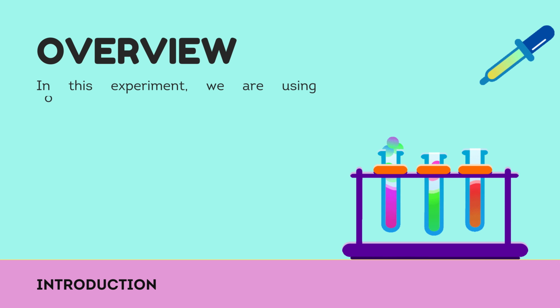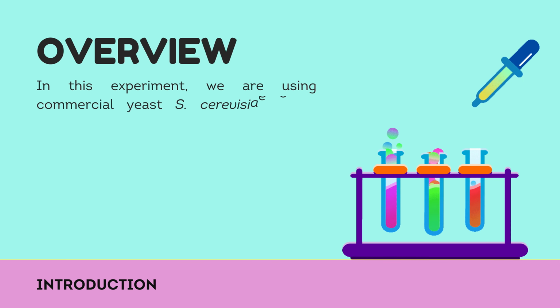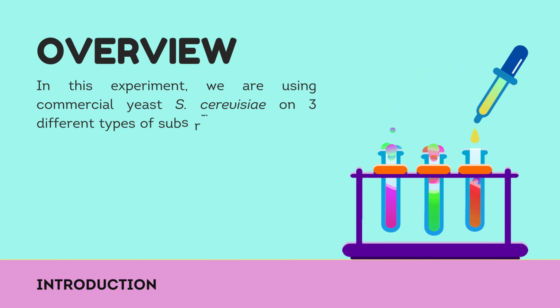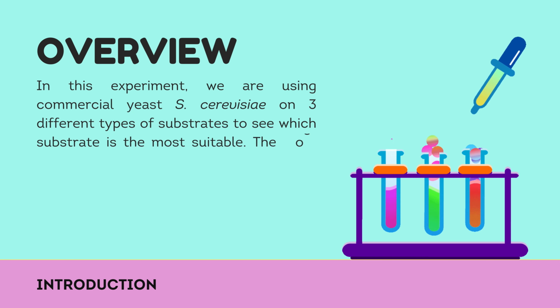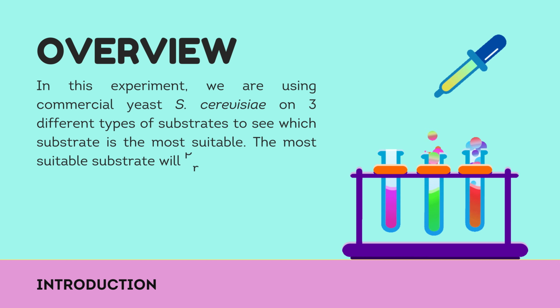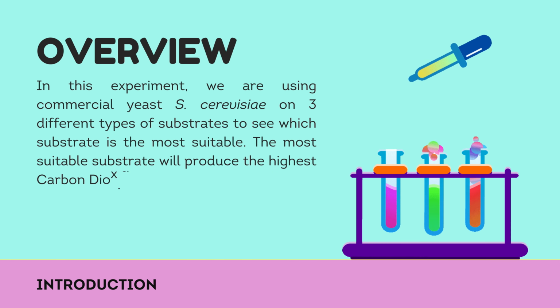Overview. In this experiment, we are using commercial yeast, S. cerevisiae, on 3 different types of substrates to see which substrate is the most suitable. The most suitable substrate will produce the highest carbon dioxide.